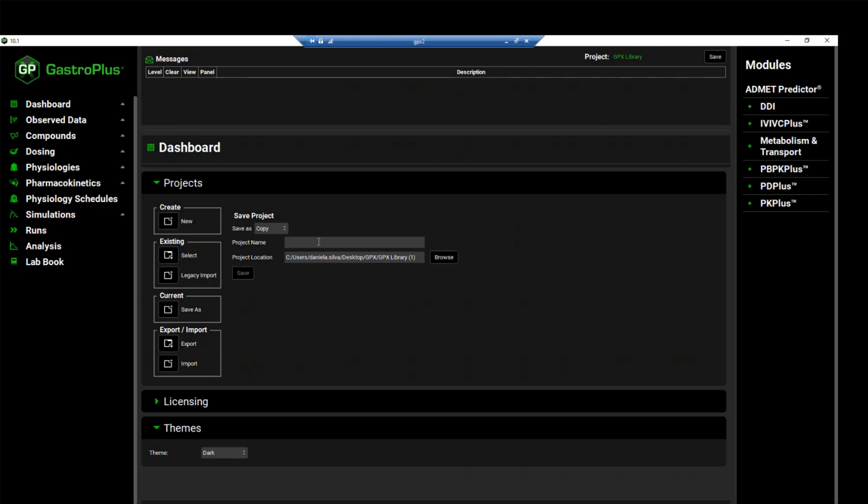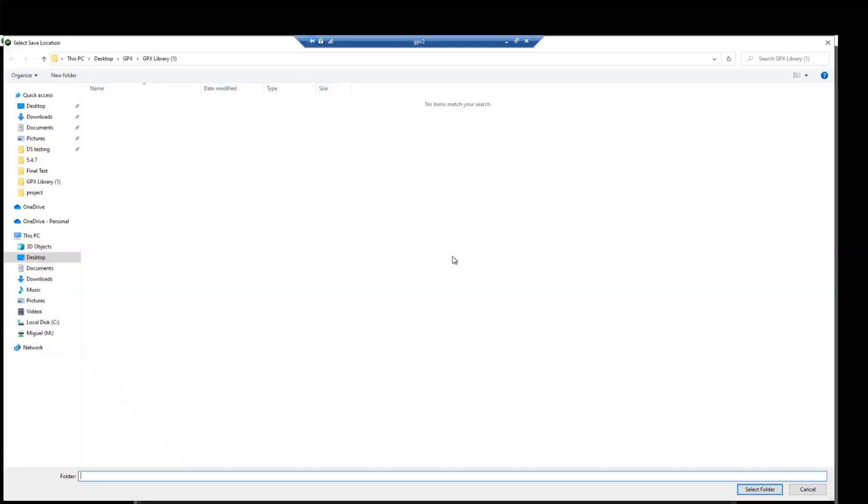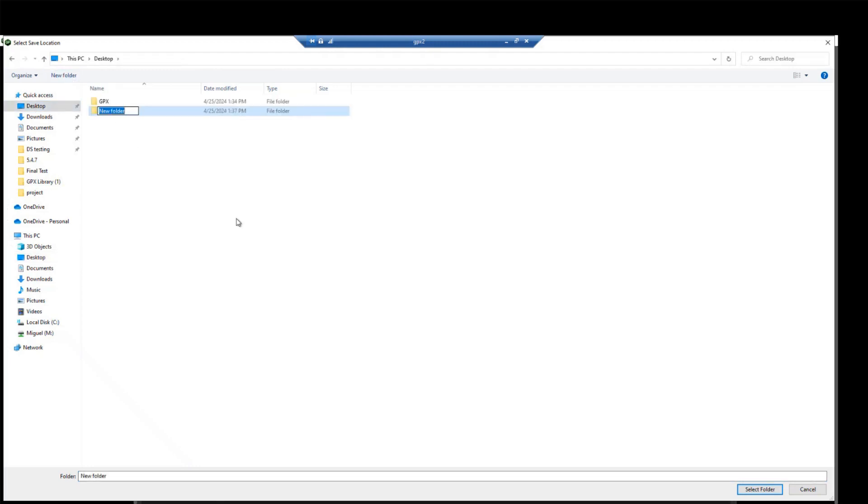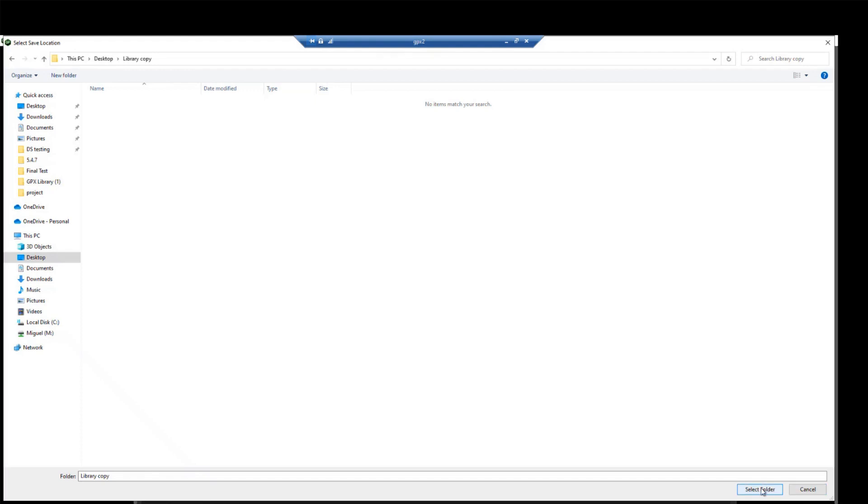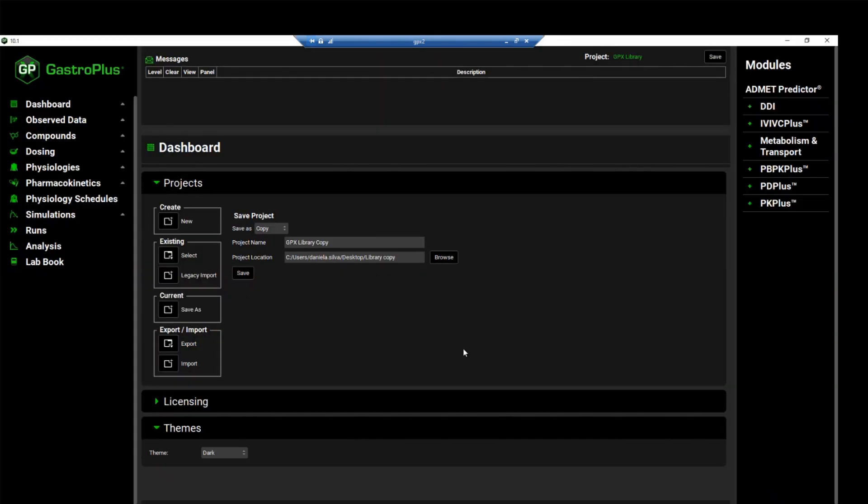We will name this project GPX library copy. You can click on browse to select where to save this project, and I will save this on my desktop. I'll create a new folder and call it library copy. And then you can click on select folder.